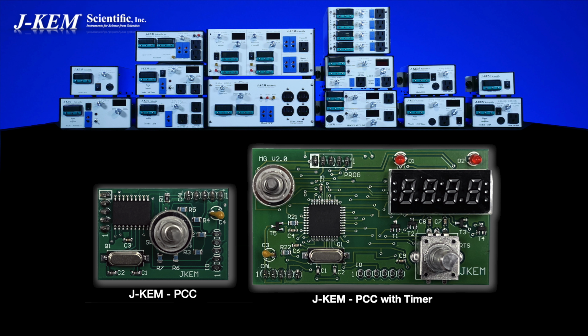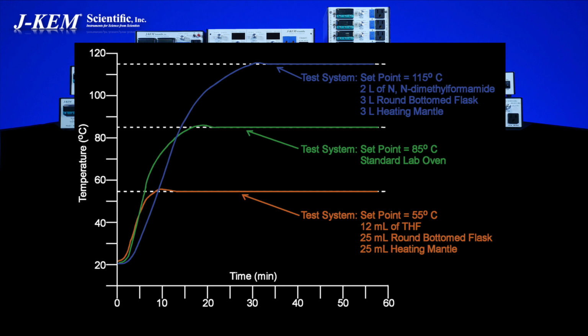Certainly the most fundamental safety feature of any temperature controller is you get the temperature you ask for. There's no other safety feature that's more important than saying I want to heat my reaction to 80 or 90 or 100 degrees. If you ask for 100 degrees, you get 100 degrees. You can punch in 100 degrees and you can walk away.